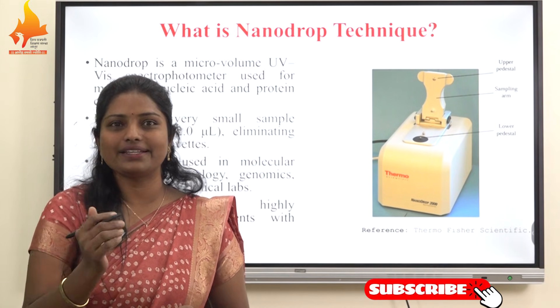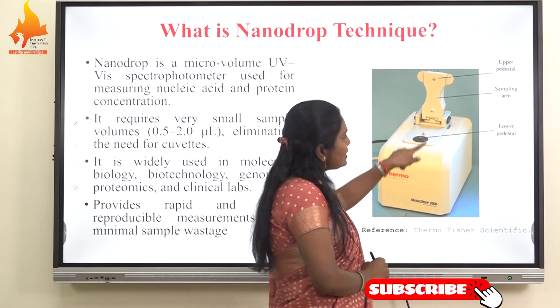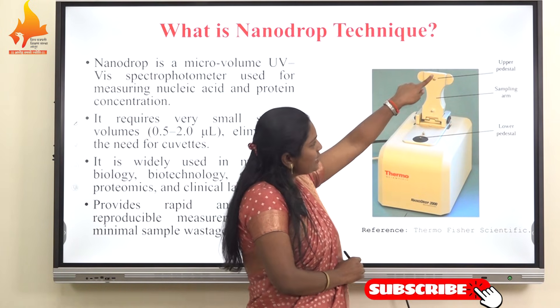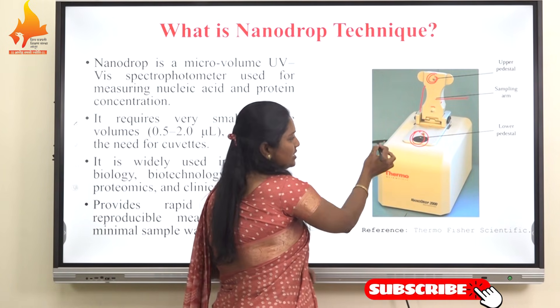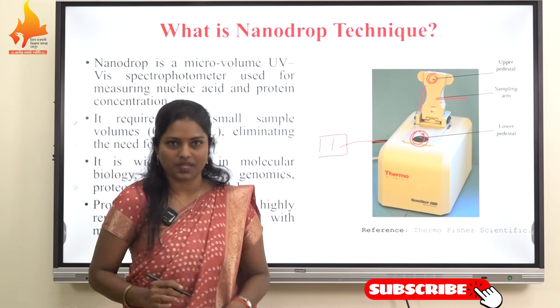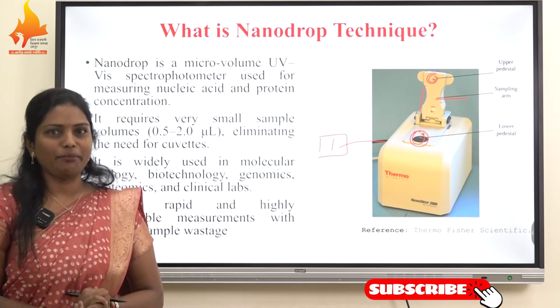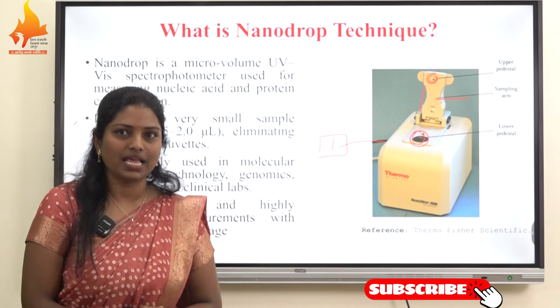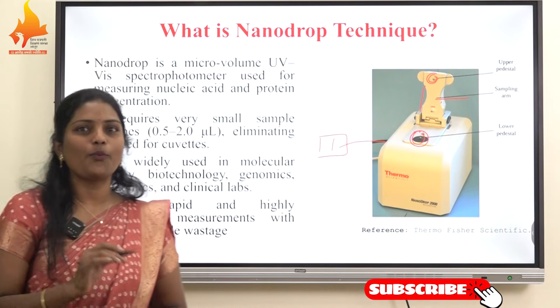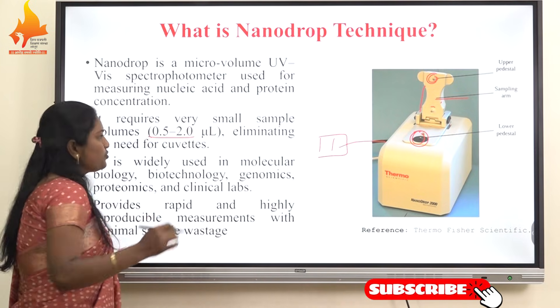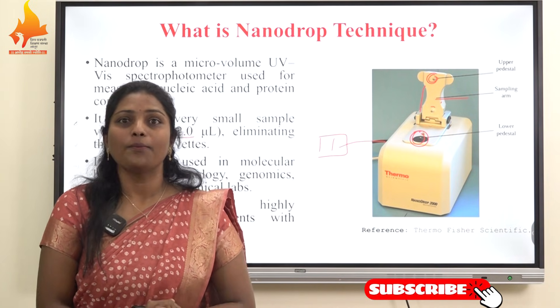This is the nanodrop instrument, which contains the upper pedestal, the lower pedestal, and a sampling arm connected to a computer with a digital display. The nanodrop is a micro-volume UV-visible spectrophotometer that measures the absorbance of biological samples in the ultraviolet and visible range. It typically requires only 0.5 to 2 microliters of sample, uses surface tension to hold the sample, and provides instant concentration and purity data.